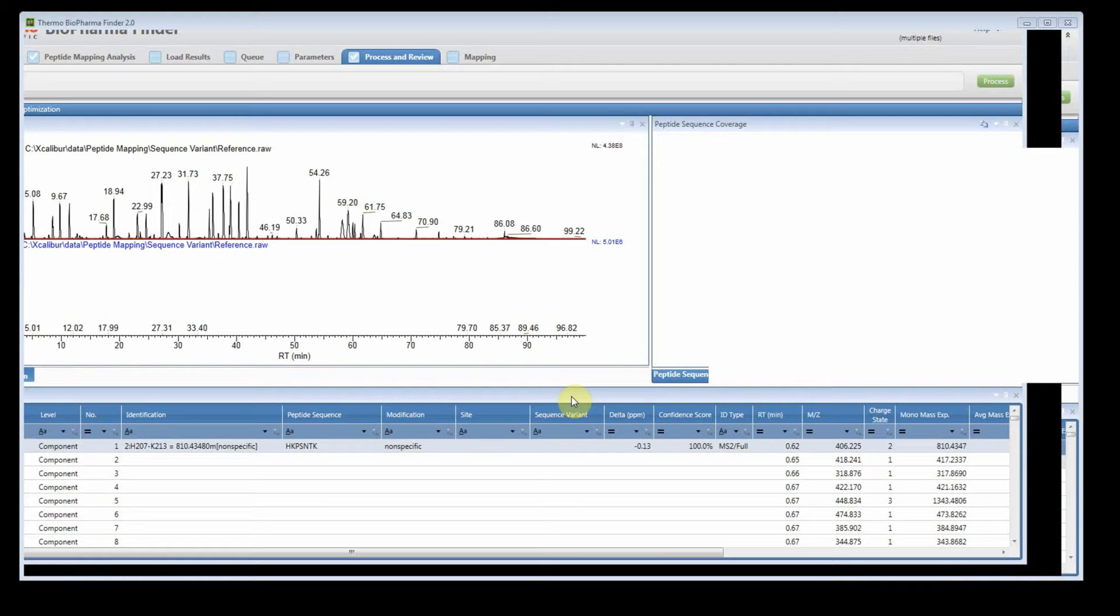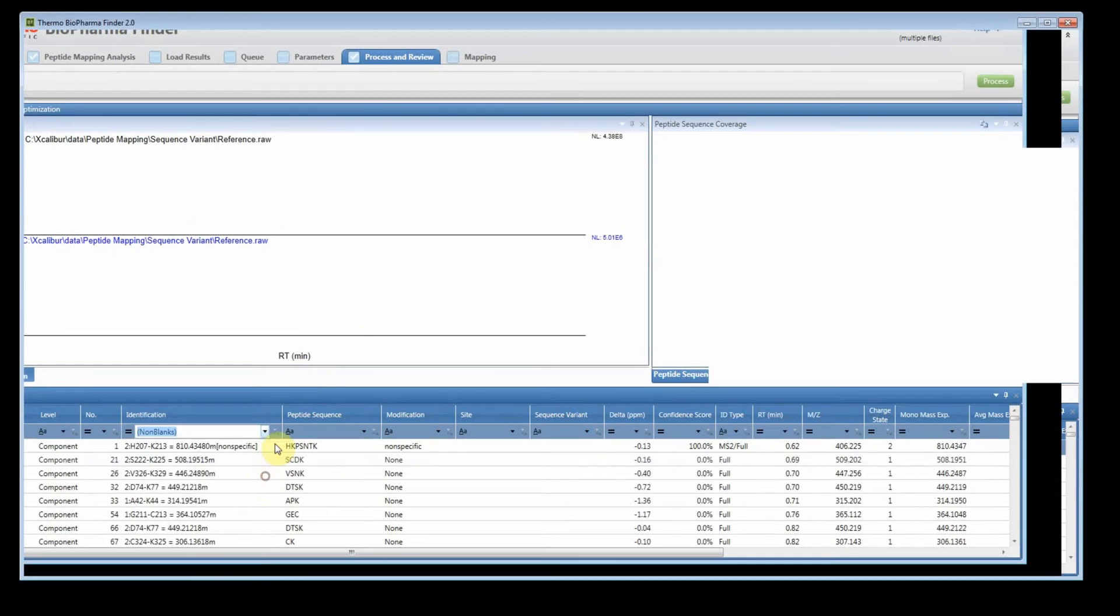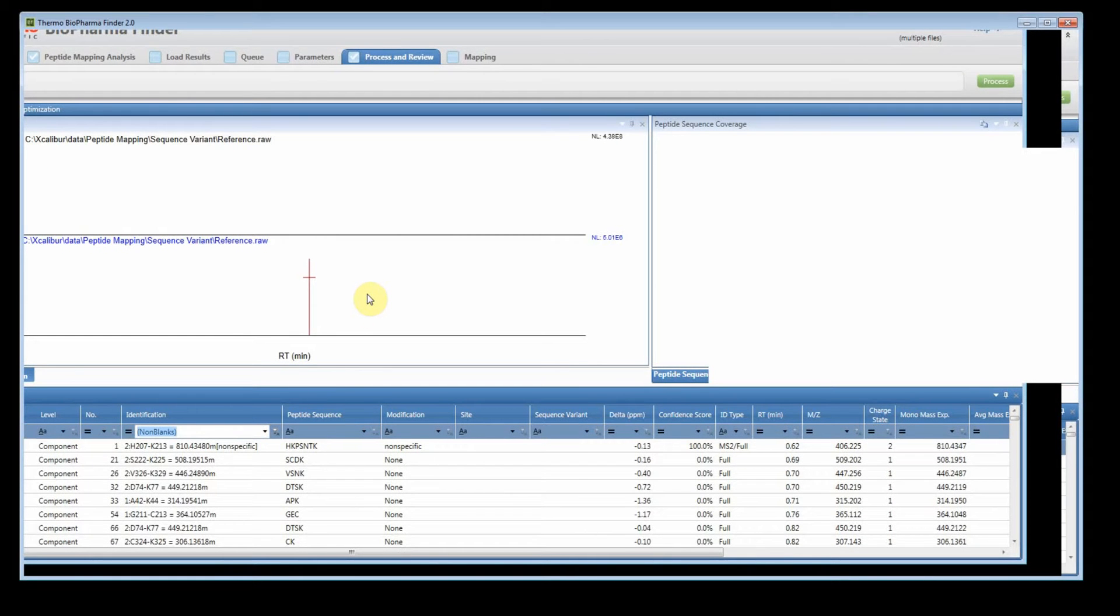On the screen you'll see the process and review page for a peptide mapping experiment. This experiment I had two raw files and it was from the NIST standard antibody sample. I have a reference and I have a treated sample, and the treated sample had a synthetic sequence variant spiked into it.